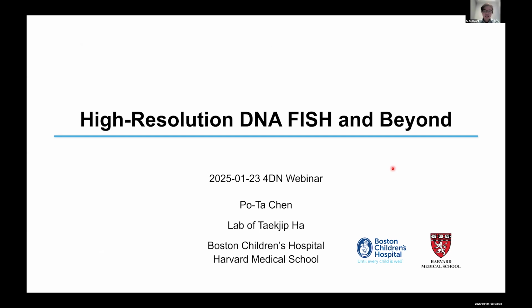So today, my research project is still in the technique development phase. I would like to talk specifically about the new DNA FISH method that we've been developing. In the first part of my talk, I want to show you how we can achieve high resolution genomic imaging with this tool. And there's a second part of my talk, which you will learn from this presentation. This talk will be more technically oriented. I have a lot of preliminary data, but hopefully this will be interesting to this community.